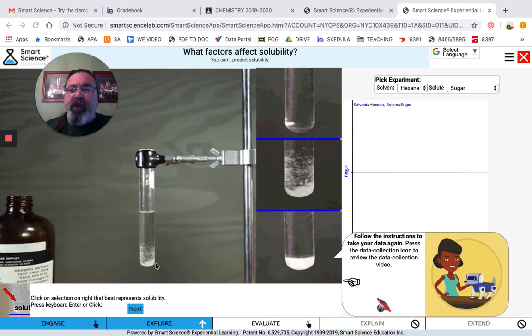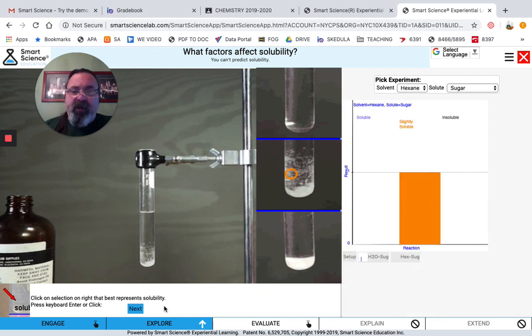So now we're going to compare the two. Which one is it? 1, 2, or 3? Right, 2. So let's go ahead and put 2 in, and we get another data point. Now, once that's complete, we can continue to do this. The student can continue to do this. I'm naturally not going to do that. More data points, the better.